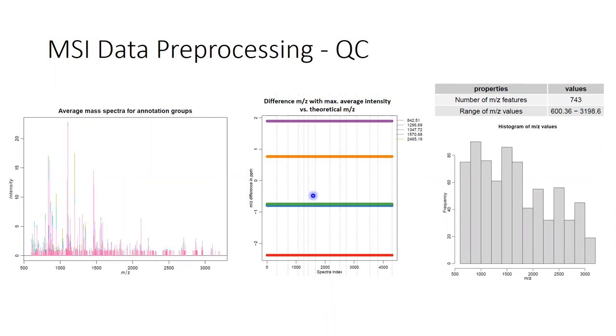And the binary QC shows us as well that the mass shift is quite low in this data set, around 2 ppm, and also a typical peptide distribution that most MSI features lie on the MSI range between 500 and 1,500 MZ.